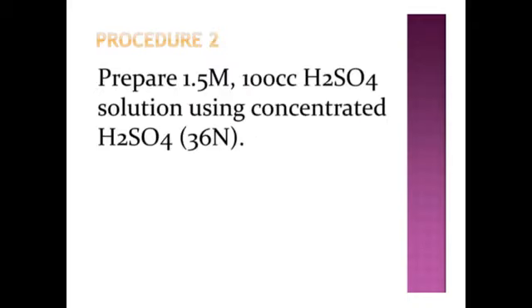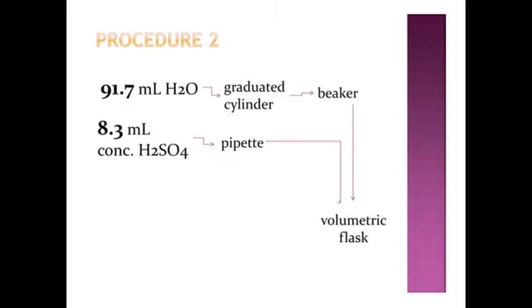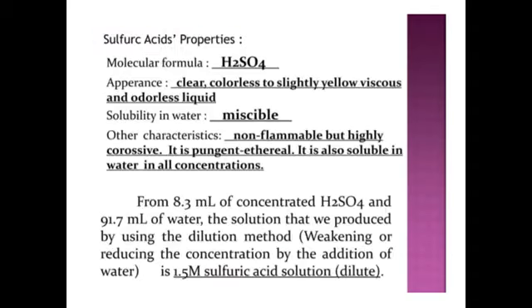So if you have done that, you have prepared 1.5 molar in 100 centimeter cube H2SO4. And other properties of H2SO4, or tetraoxosulfate-VI acid: the molecular formula is H2SO4. Its appearance is a colorless, clear liquid, or slightly yellow, viscous and odorless liquid. It is miscible in water. It is non-flammable but highly corrosive. It has a pungent, ethery smell, and it is also soluble in water in any concentration.